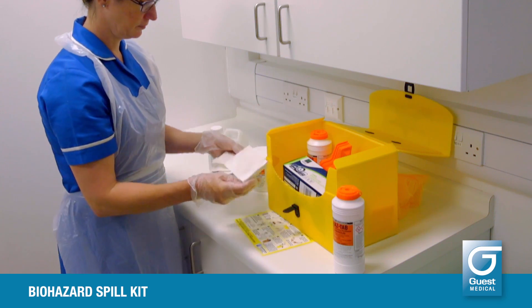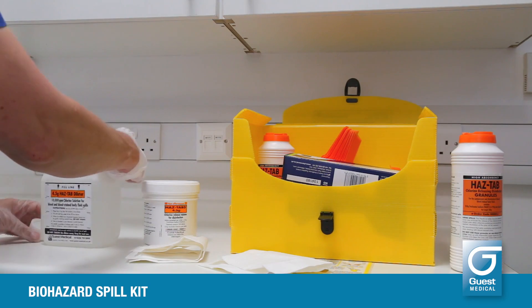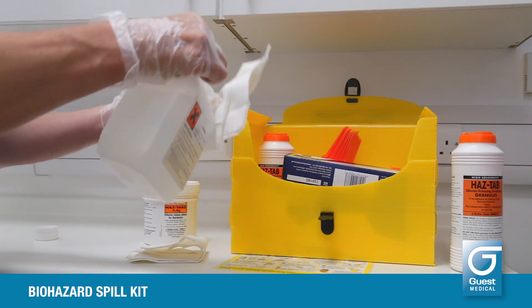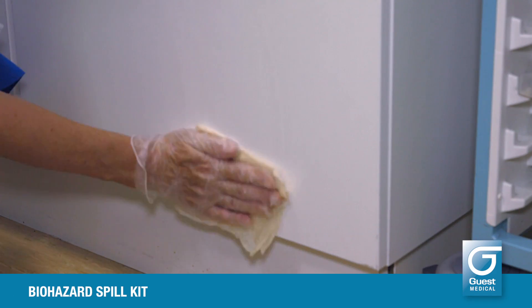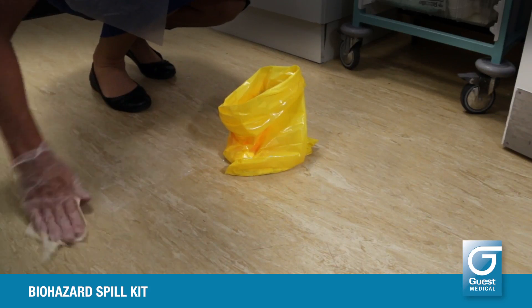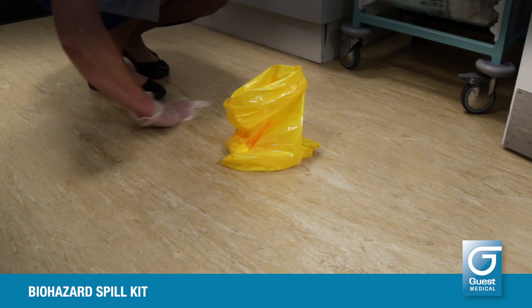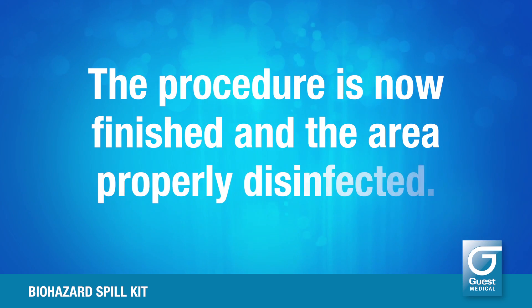Use the disposable scoop and scraper to collect the spill granules mixture and discard all into the waste bag. Use the solution on the disposable paper towels from the kit to wipe away splashes, drips and any smears. Discard the paper towels into the waste bag as you use them. This solution may also be used to clean away any smears left in the area of the spill absorbed by the granules if necessary. The procedure is now finished and the area properly disinfected.